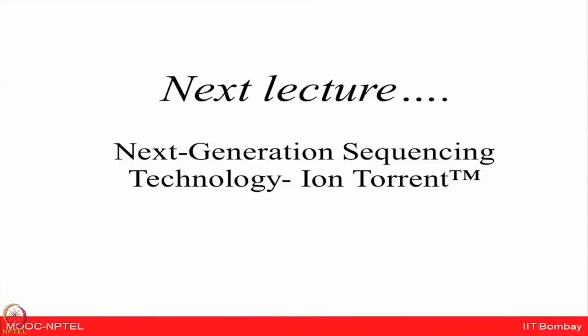So, I hope now you are convinced that SPR based systems is a very powerful platform to generate high quality data for biomolecular interactions, especially to obtain the dissociation constant, the Kd values, on rate, off rate, the kinetic data, which could provide you very quantitative valuable information. We will discuss some other technology platforms in the next lectures. I hope till then you will study the SPR and associated label free biosensor technologies in more detail. Thank you.